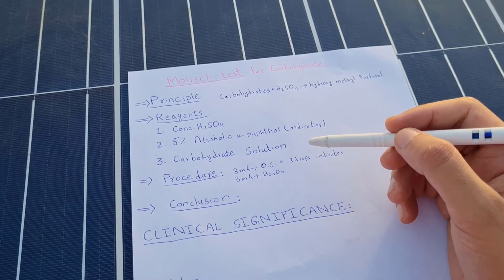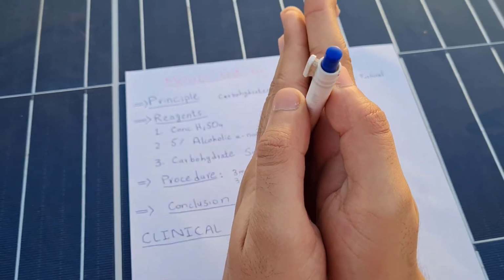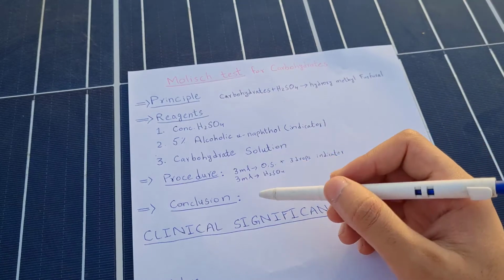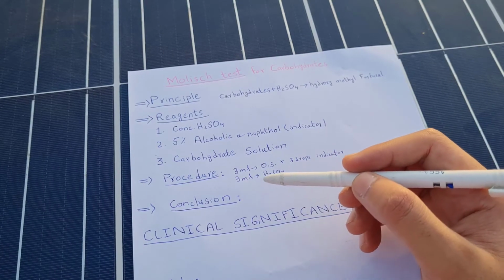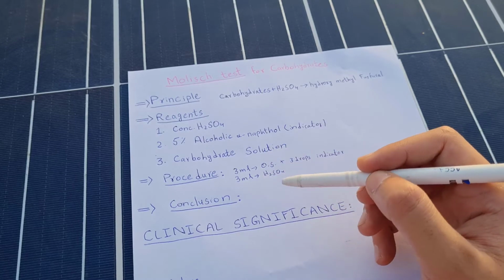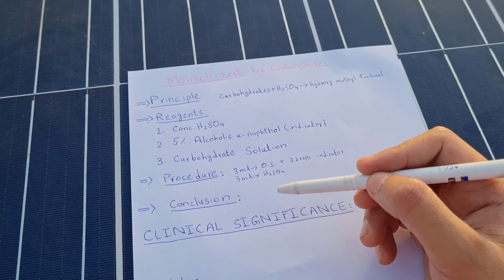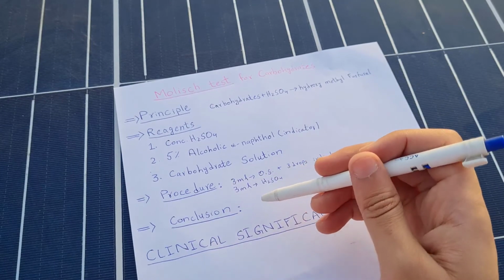Then we will wait for a moment and roll the test tube in our hands like this, so that the solution is mixed thoroughly. If carbohydrates are present, we will see a violet colored ring at the junction of these two solutions. This is an indication of the presence of carbohydrates in the given solution. So the conclusion will be a violet colored ring.